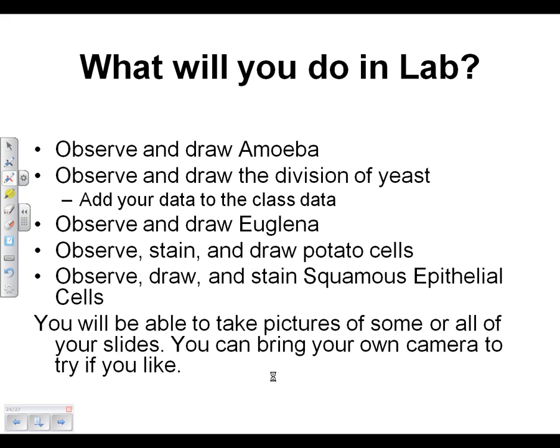All right, so there's all the historical background and things on how to use a microscope. Now the cool part, the things we get to actually look at this week in lab. The fun thing is you're going to observe and draw an amoeba. The thing to remember about the amoeba is that most of the time we buy commercial amoeba cultures, so we don't have to keep them going ourselves.